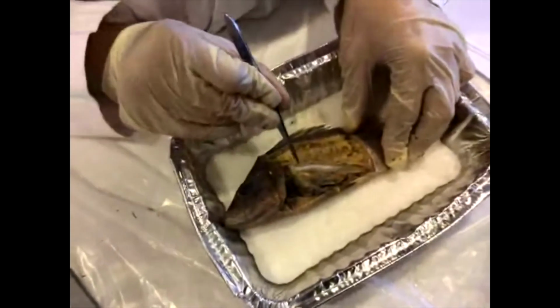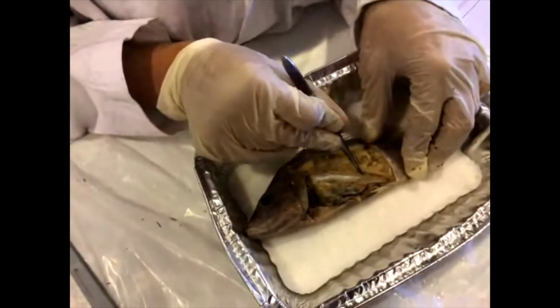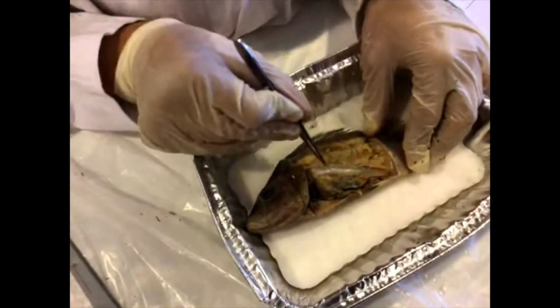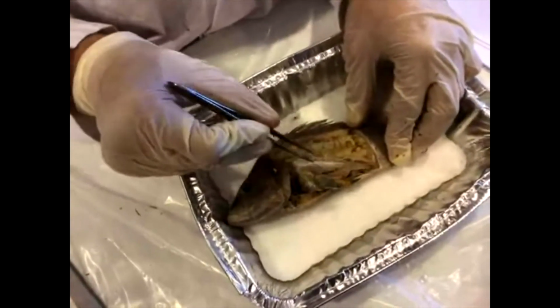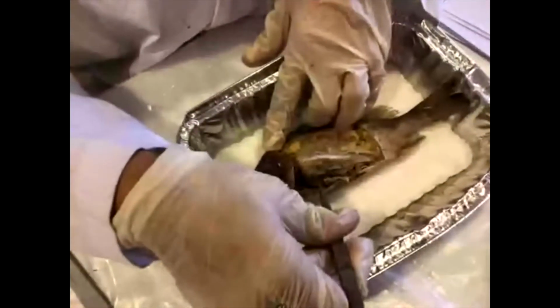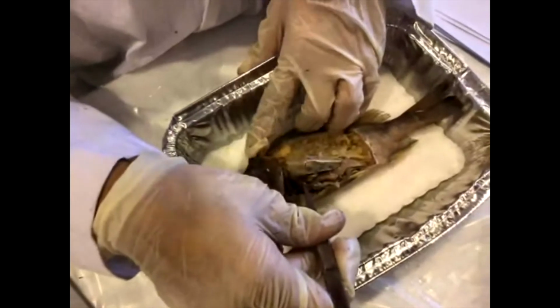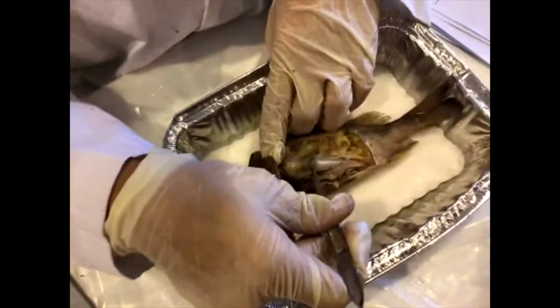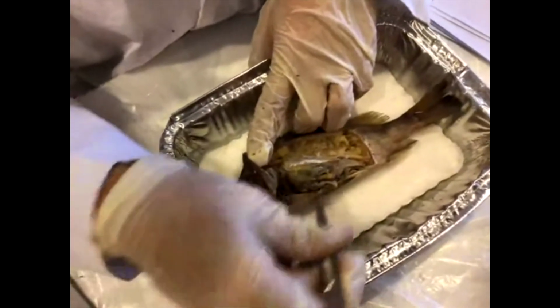So again, maybe we remember what this big gas-filled sac is called. Humans don't have them because we don't need to float. Well, not usually. This is called a swim bladder, so it fills with air. We've got this big lobe, one of the most important organs. It's the liver. So it detoxifies the blood, it filters the blood, it helps produce chemicals that help digestion.